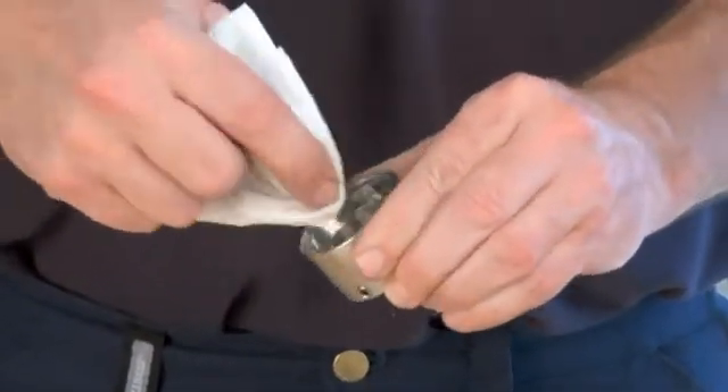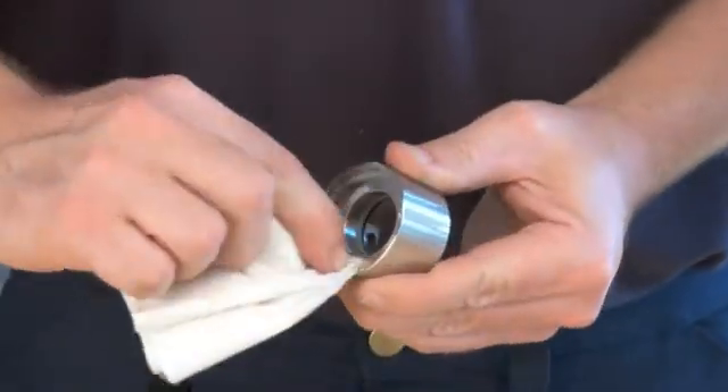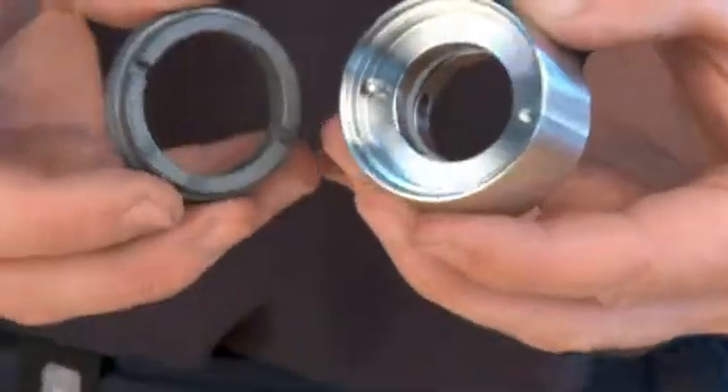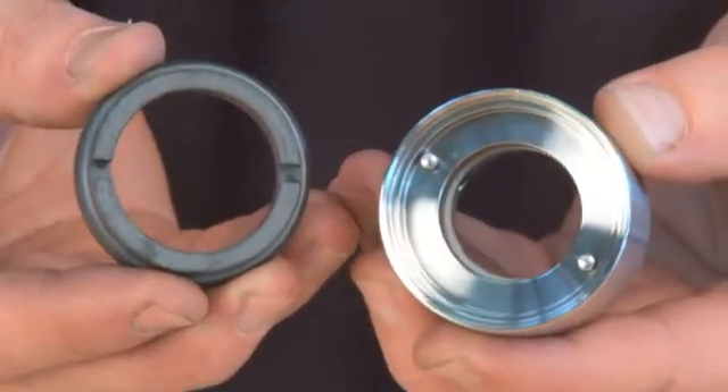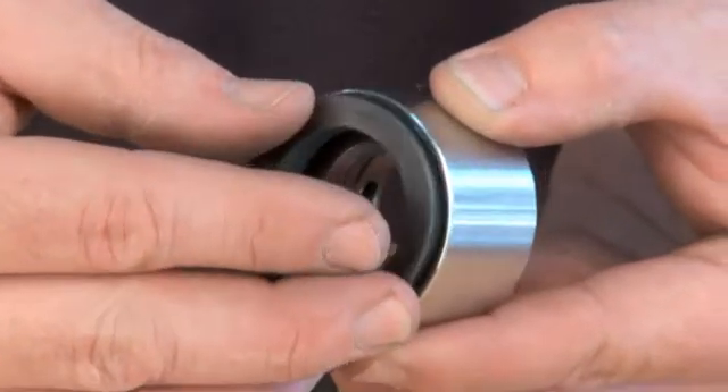Clean the seal housing with alcohol. Place the rotating part of the seal into the counter ring without an O-ring to check that the height of the pins is correct.